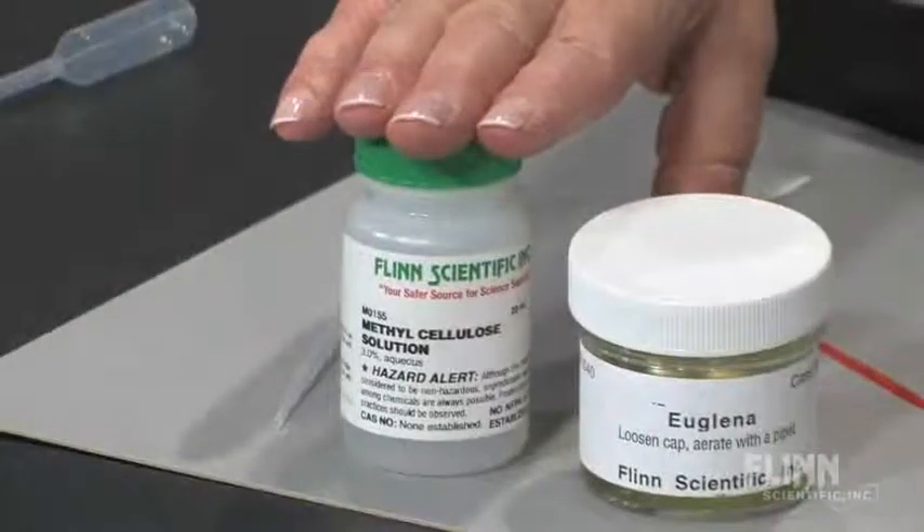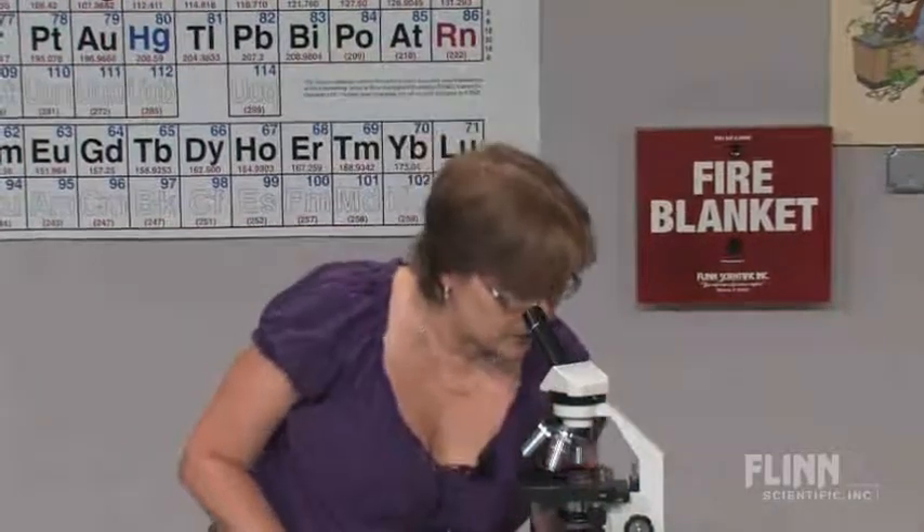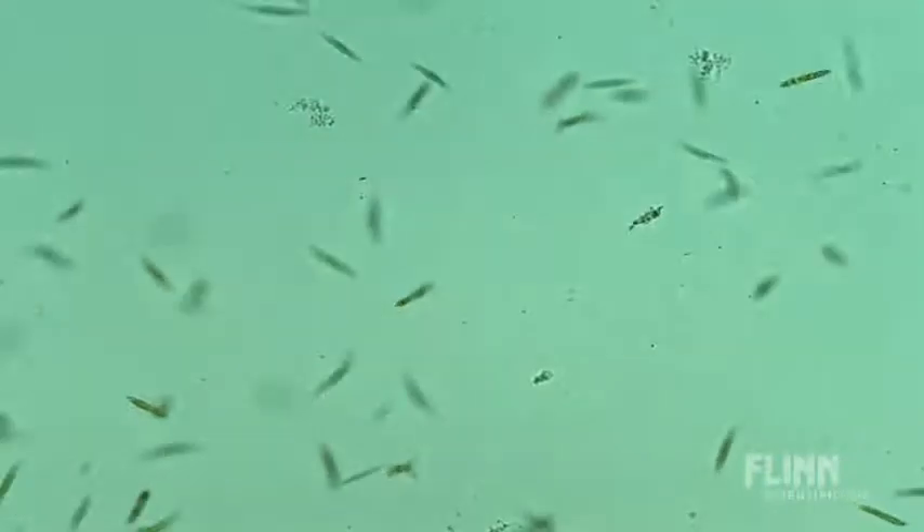Now from here, it depends on what you want to do with the culture itself. If you want to study the internal organs of the euglena, you're going to want to use a drop of methylcellulose solution or glycerin, preferably methylcellulose, to slow them down. Glycerin can affect their longevity and they may die quickly with glycerin. So you're going to view the euglena as they swim around.